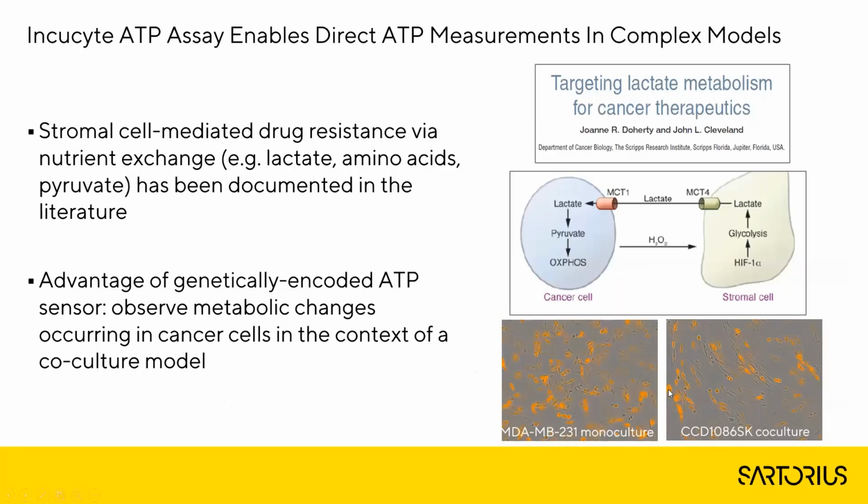But that's very simple, right? So in this case, it's a very blunt tool, taking 2 blockers that block glycolysis and block the TCA cycle. It really doesn't give you a good feeling about how this would work in a more complex model. And so what we did was we applied this to the observations, as I had mentioned before, with CB839.